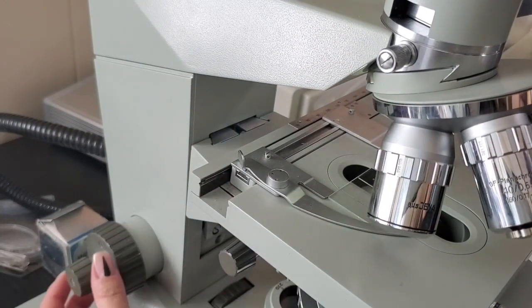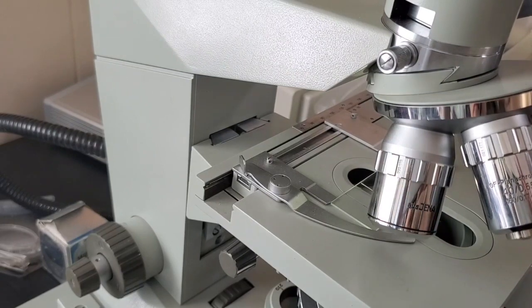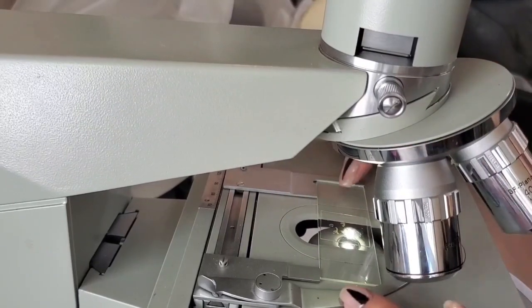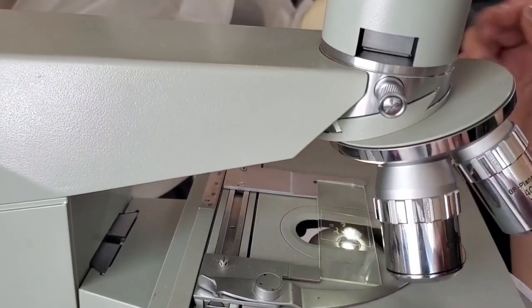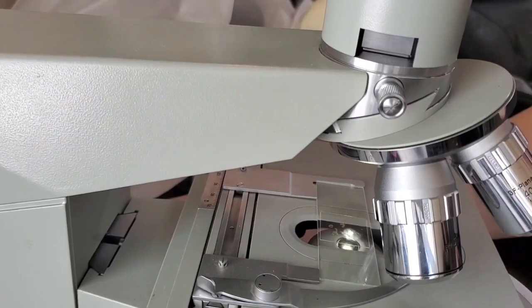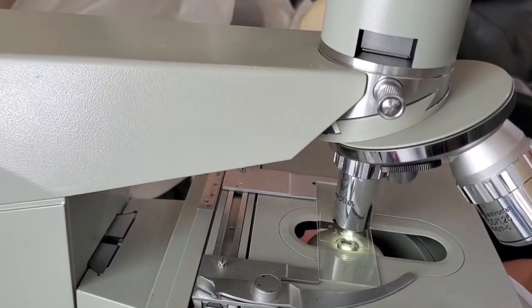And then we're going to look at where I placed it. You can always guide yourself with the light. Let me just see if I can get this to show. So you place your slide where the gills are upside down looking to you. You place it without any objective being in place. You can use the light to guide you as to where you should be. So as you can see, there's that little circle that's right on top of our gill. And now we're actually ready to look at our first objective and see what we've got.